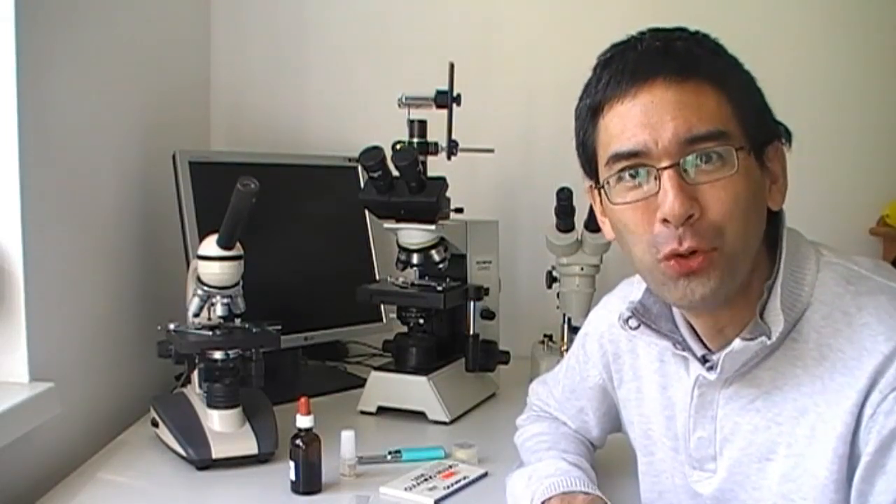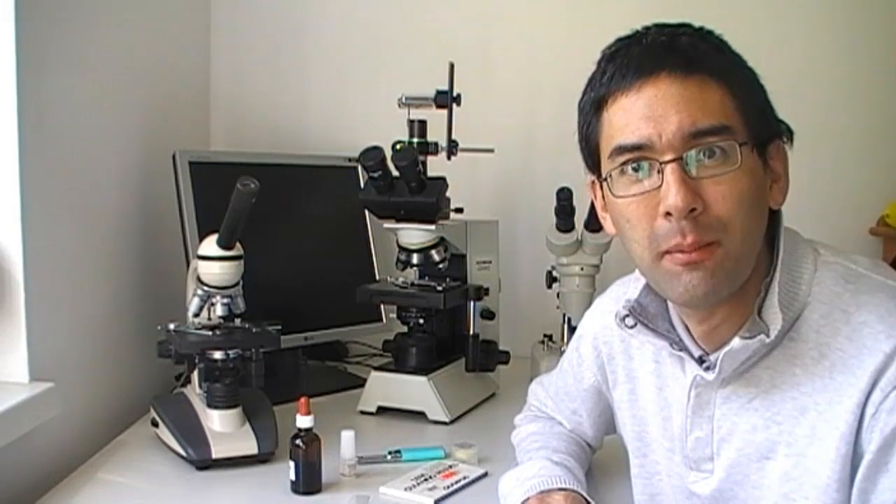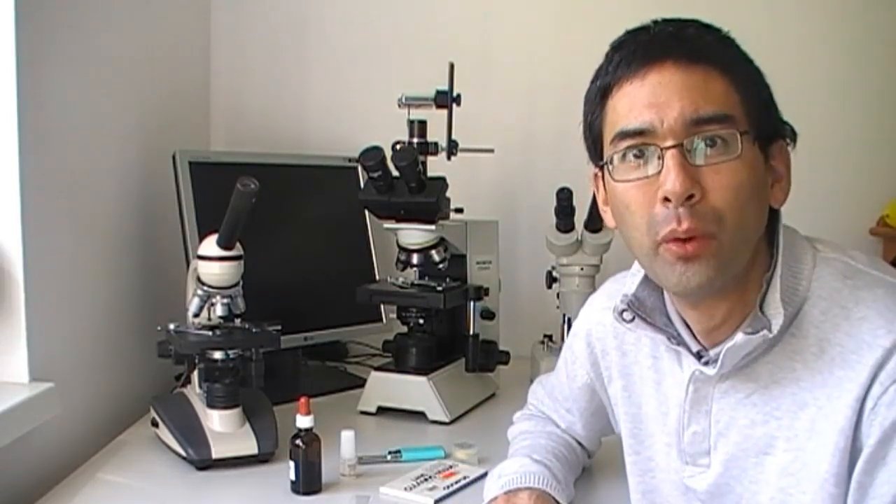In this video I'd like to show you how to prepare a slide for oil immersion observation. We will be doing some slide preparation — I'm going to extract some cheek cells from inside my mouth, we will be staining them, and we will be looking at them under the oil immersion objective.